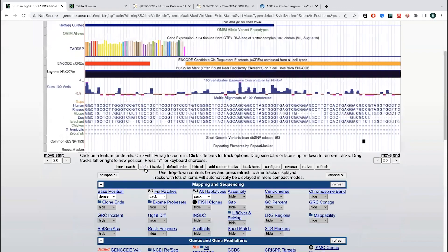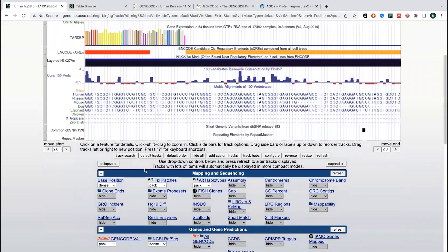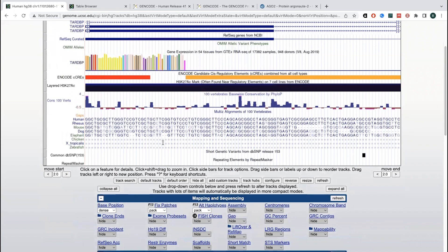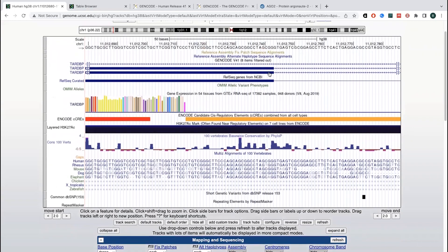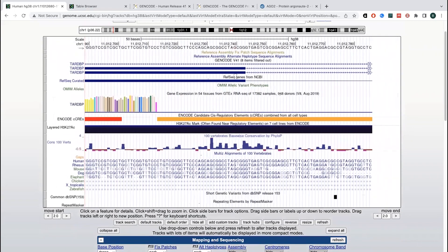do things like see where this gene starts, where this gene stops, where this gene starts, where this gene stops, exon boundaries.